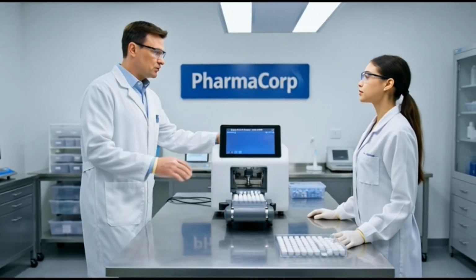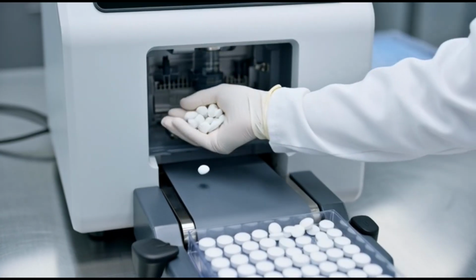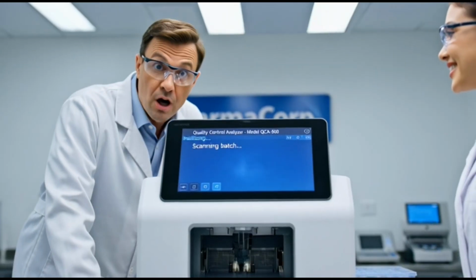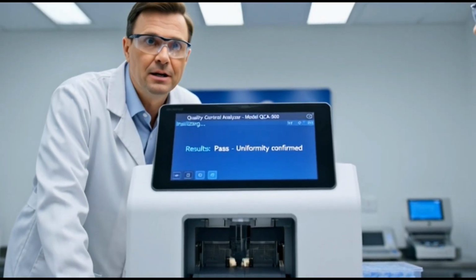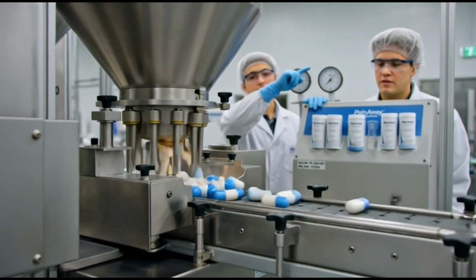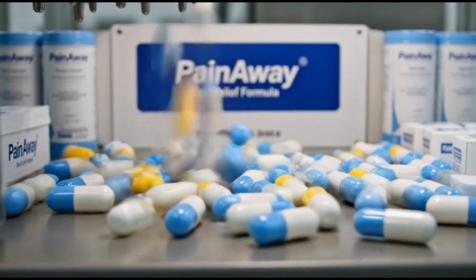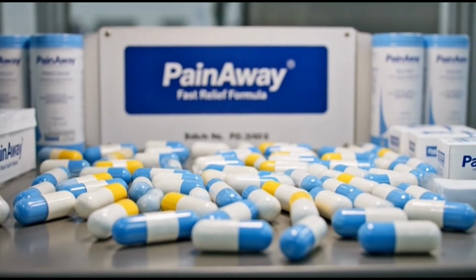Let's test this batch for uniformity. Ready. Loading the sample now. Results are in, uniformity confirmed. Excellent. Hoppers are loaded, starting the fill cycle. Tamping at 98% efficiency, capsules are sealing perfectly. Final check complete, ready for packaging.